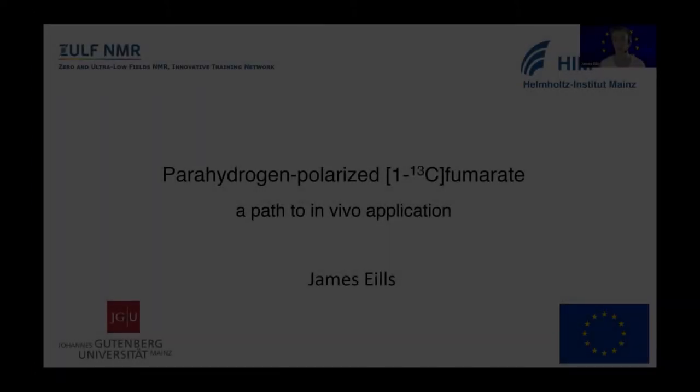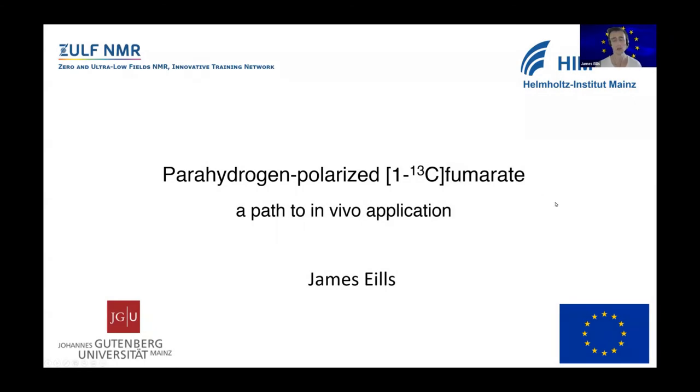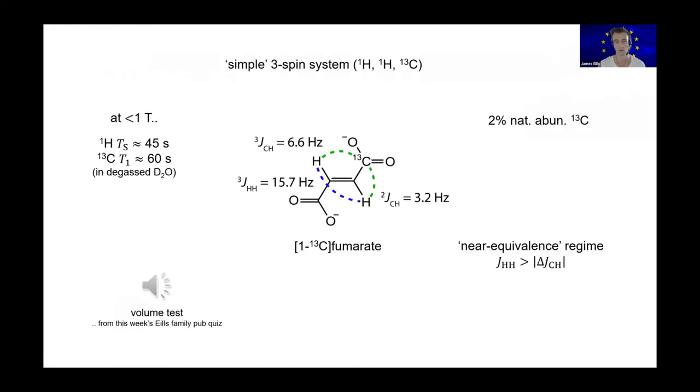called fumarate and show how it can be polarized via parahydrogen. And I believe we now have a path to take this to in vivo application. So, without further ado, I'll get started. I'm just going to put up this slide with some of the facts about this molecule on it.